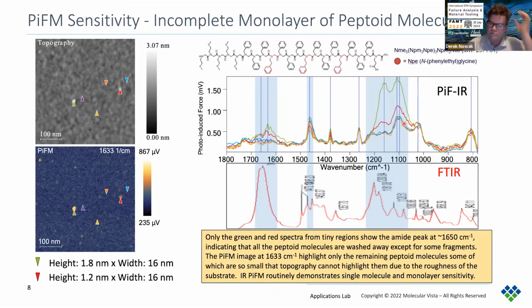Some of the other peaks here that you're not seeing changes in are because those are not part of that molecule. Those are contaminants that are part of the sample process. There's a little bit of siloxanes that are known to be part of the process, and also some plasticizers. So we're picking up those residuals as well. So like I said, quite a sensitive approach.